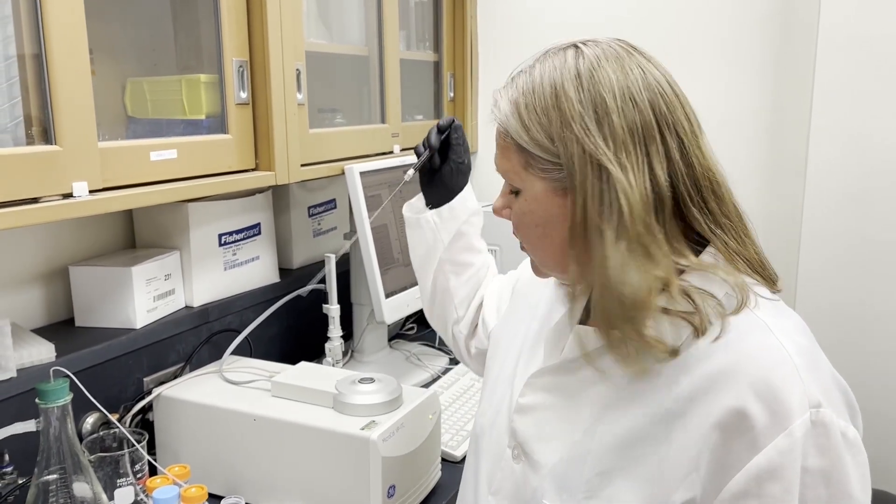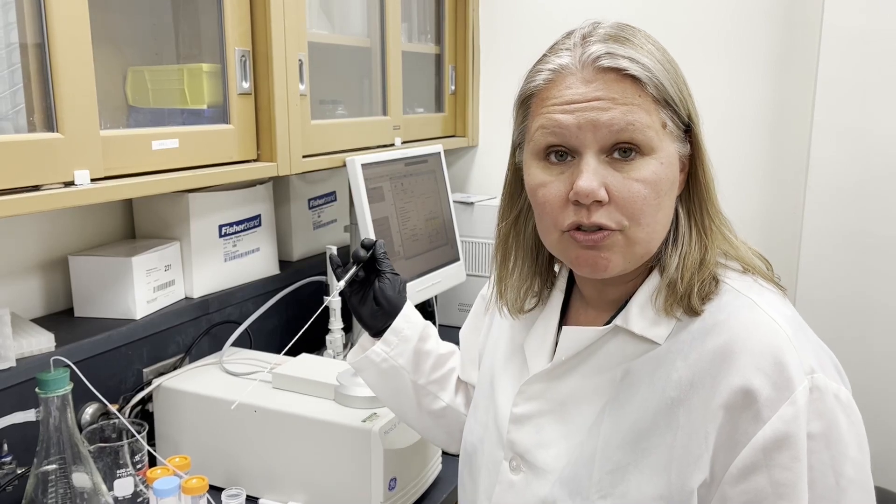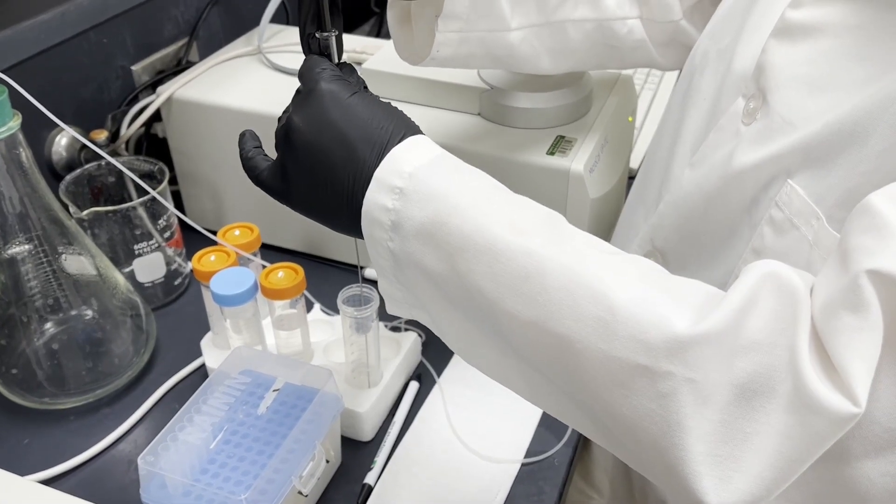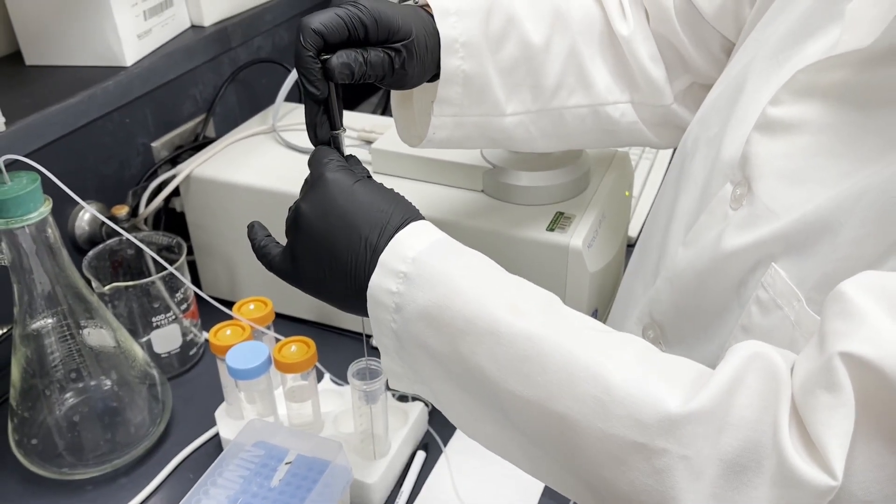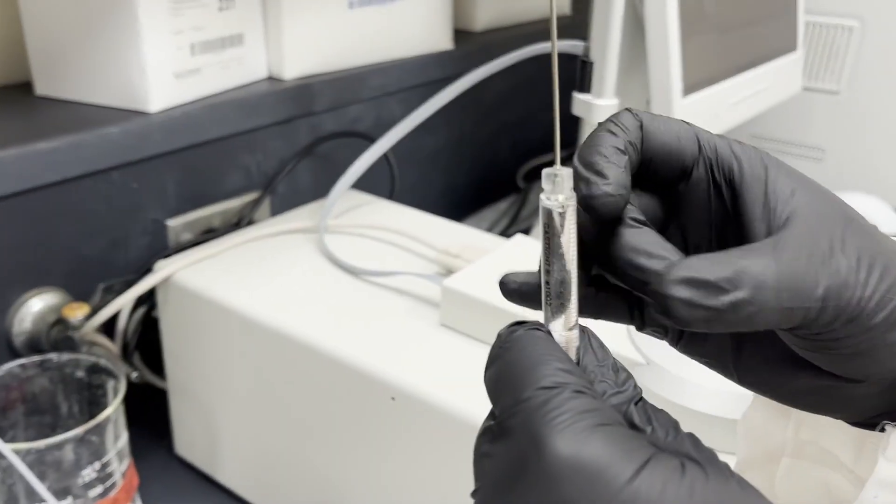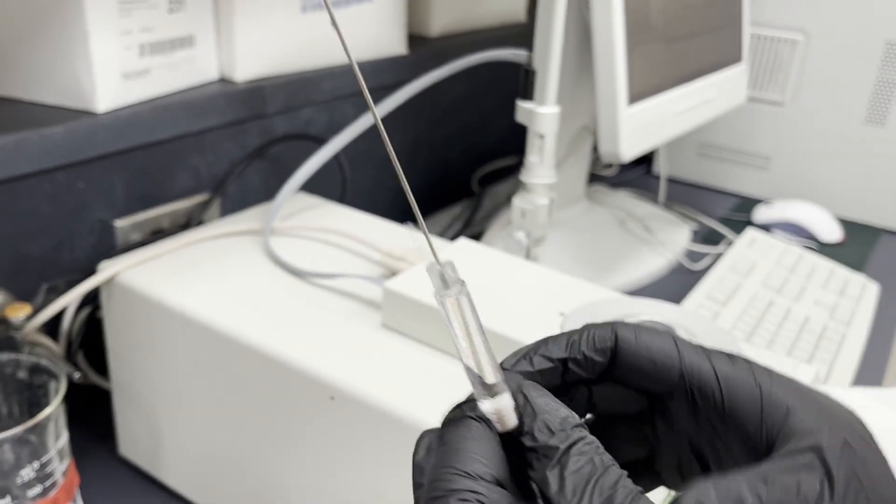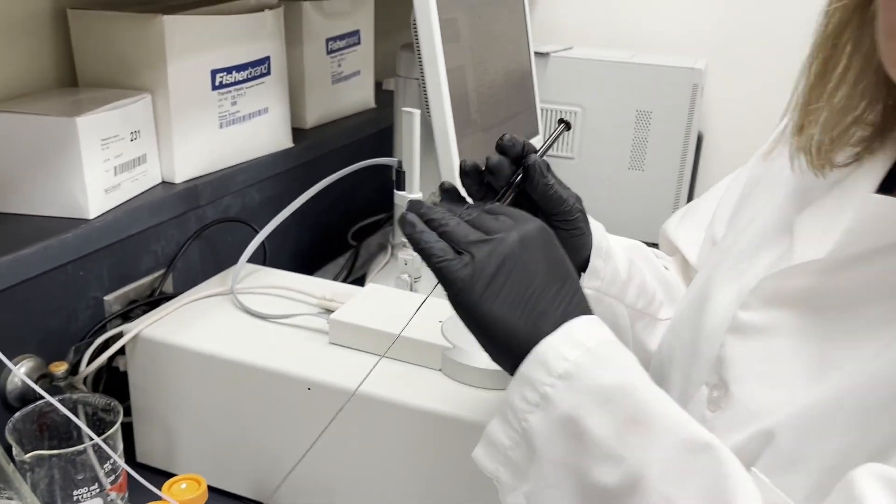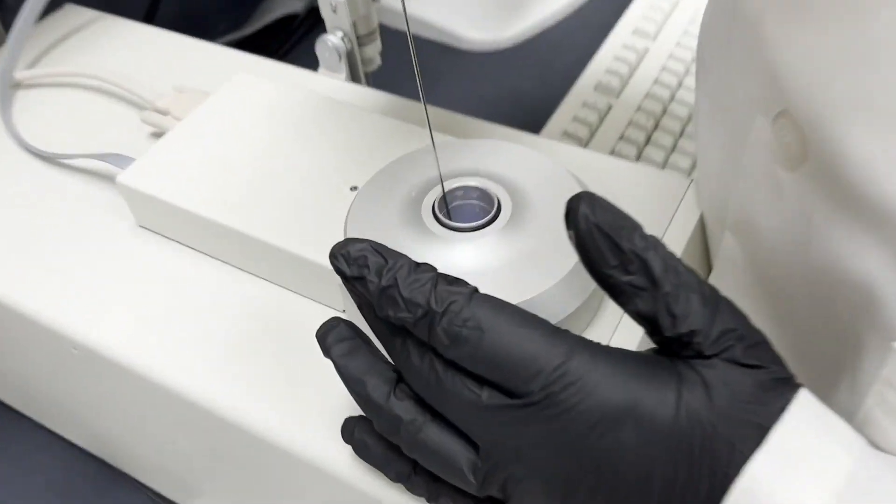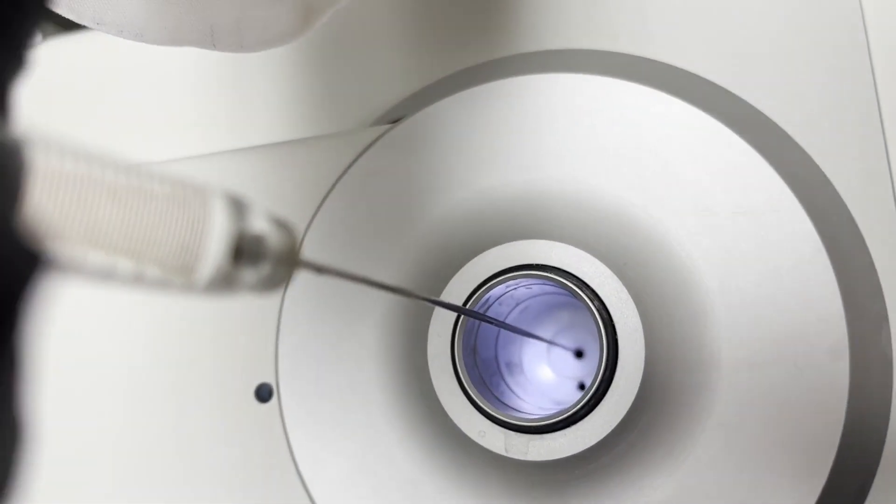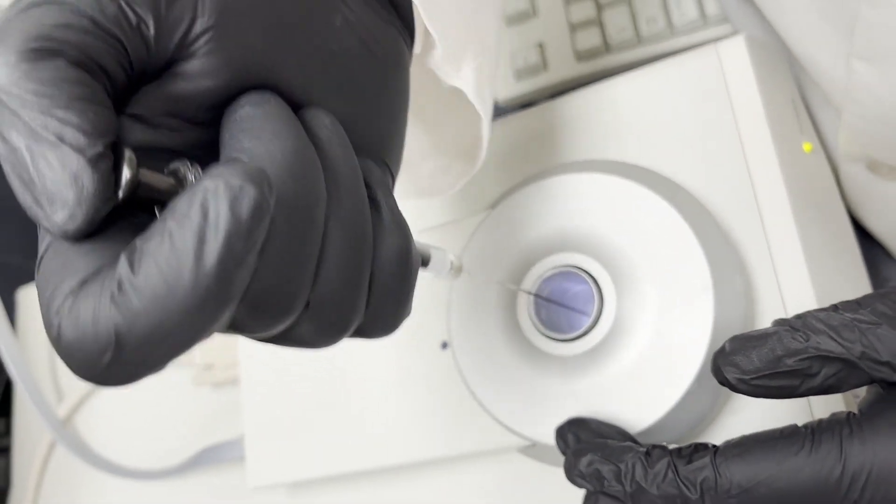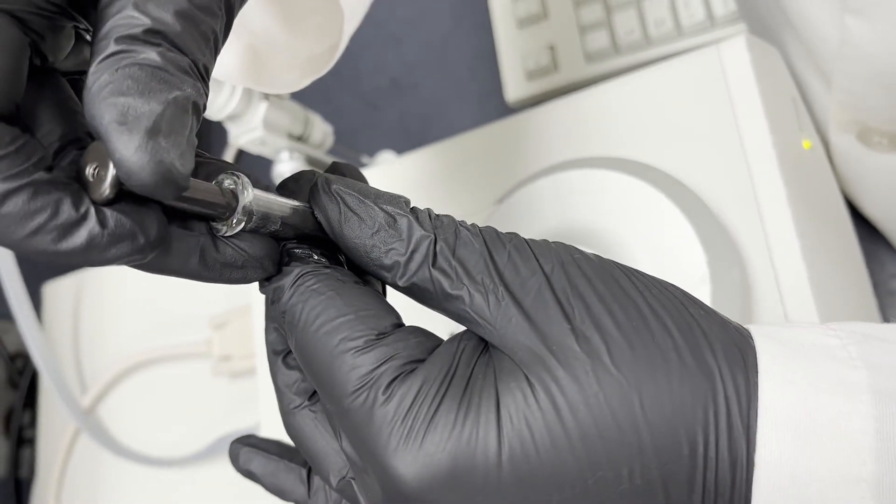While your sample is degassing, you also want to rinse out the sample cell and the injection syringe with your buffer of choice. Again I'm just using water, but pretend this is your buffer. Another thing that ITC does not like are bubbles, so you want to try and get all of them out of the Hamilton syringe. To rinse this out, you just simply inject it slowly into the sample cell and then remove it.